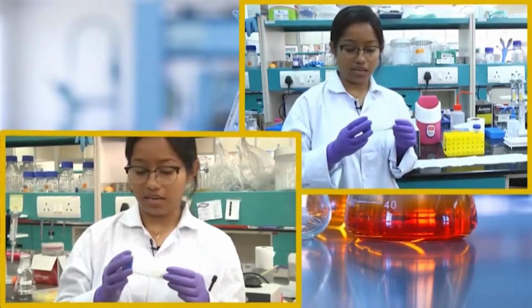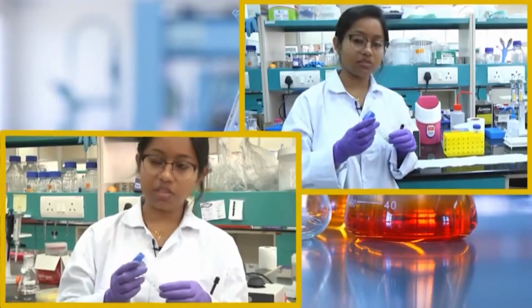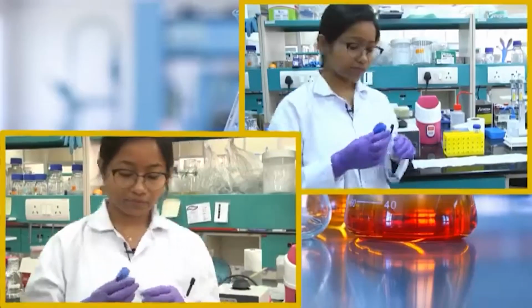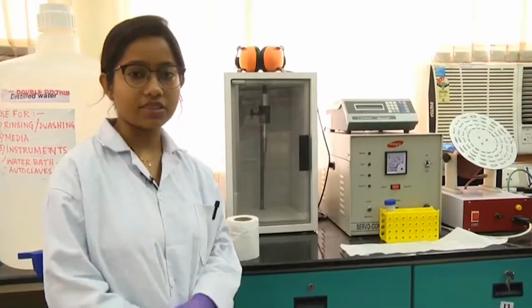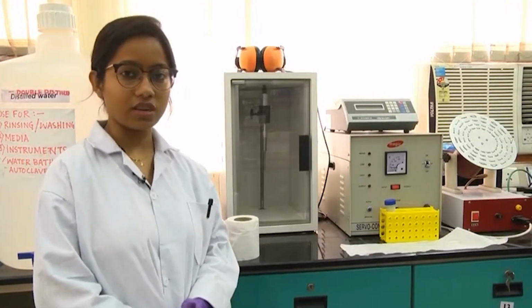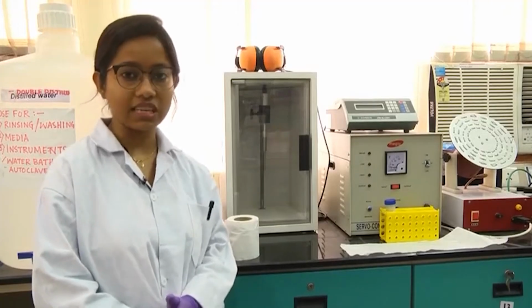After the sonication is done, you will see the solution becomes more clear again, changes color a little bit, and becomes liquid-like again. So, this is a sonicator machine. It generates ultrasonic sound vibrations, and because of those vibrations the cellular membranes and the big molecules like DNA and RNA become degraded.